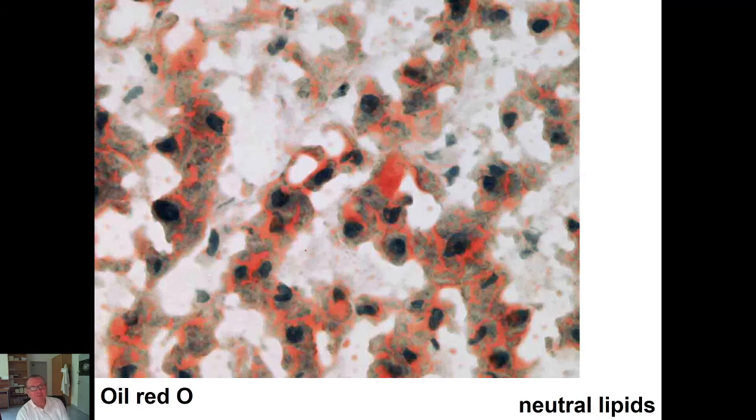Lipids are stained in frozen section, where the structure is never so well preserved as in the chemically fixed and paraffin embedded tissue. But the advantage of the freezing is that we can stain lipid droplets because they are not exhausted and extracted.